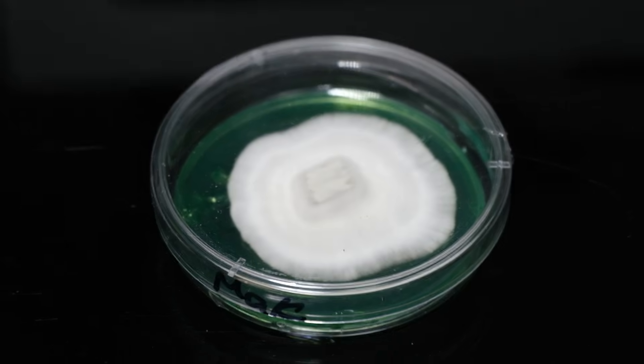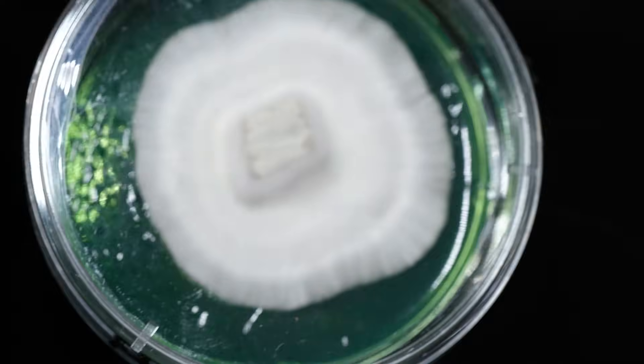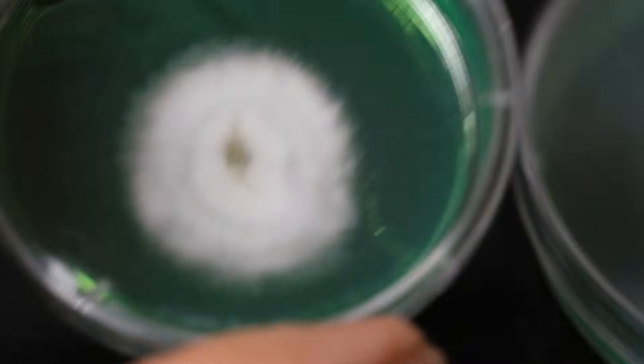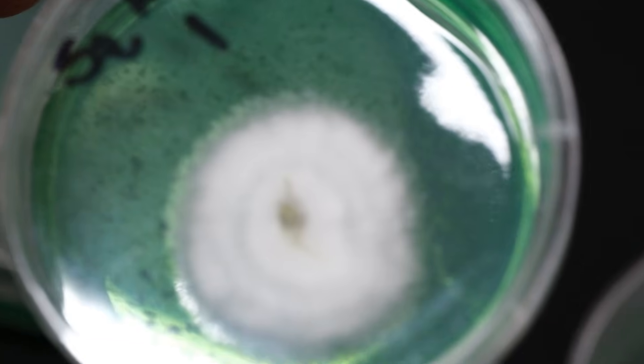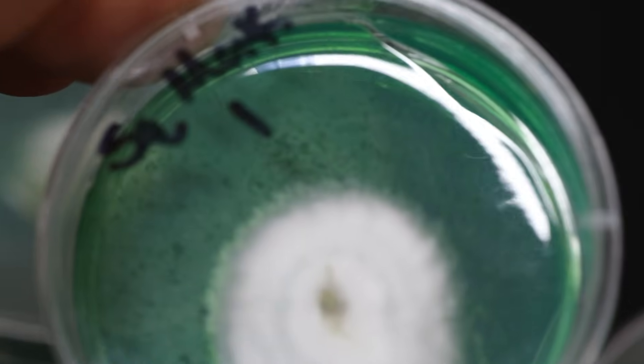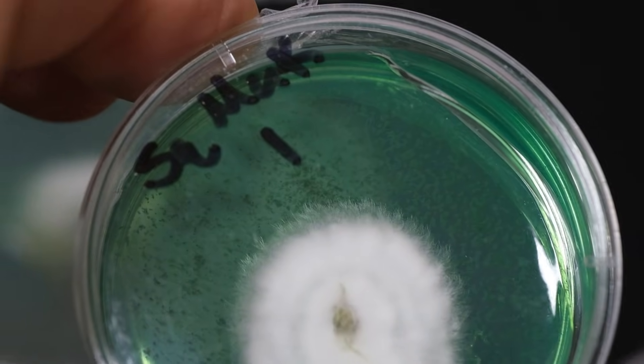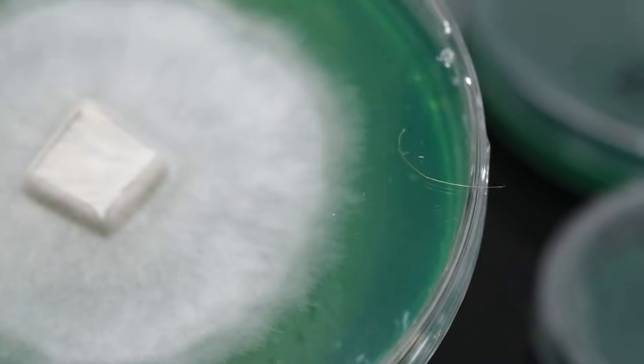Let me show you the difference between a clean plate and a couple of plates I suspect to be contaminated, so you know what to look for. Here's a clean plate — notice how clearly defined the leading edge of the mycelium is; there's no halo, no glow, no sheen. Now compare that to these plates. This is a clone — cloning is not a sterile process, so sometimes bacteria gets carried along. You just see that little halo around the mycelium — that's what we're looking to separate and isolate.